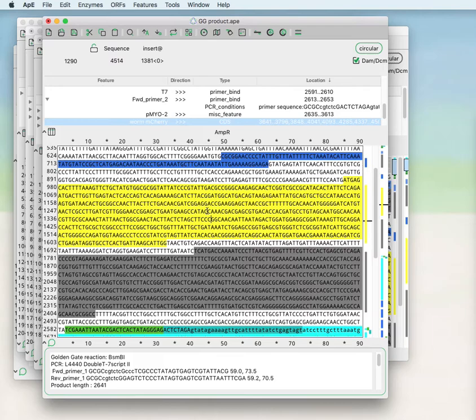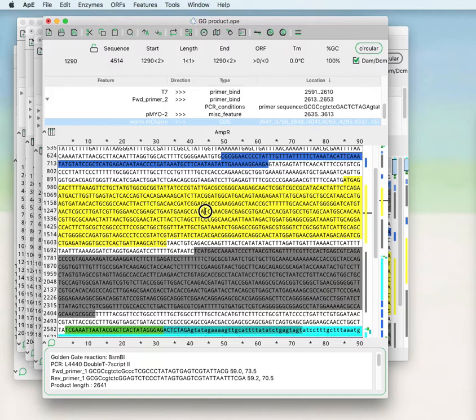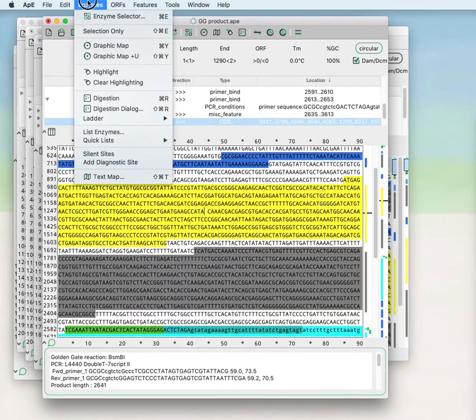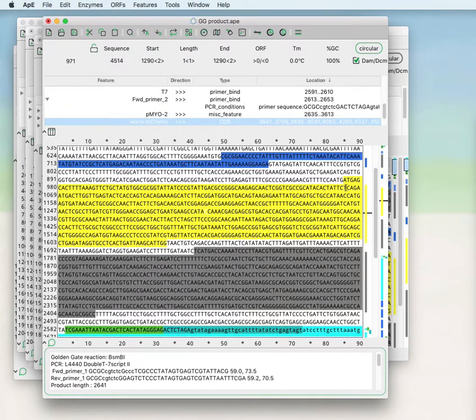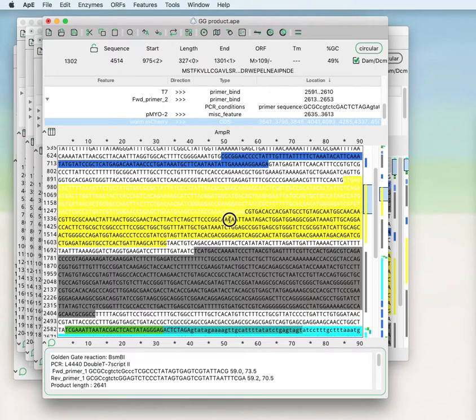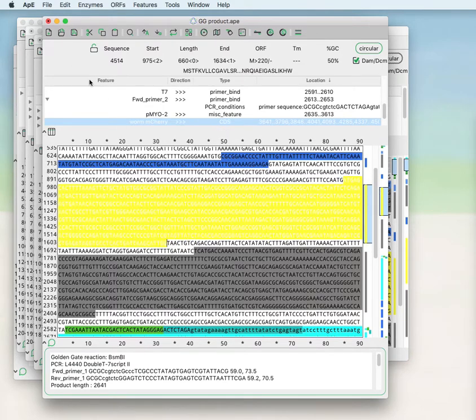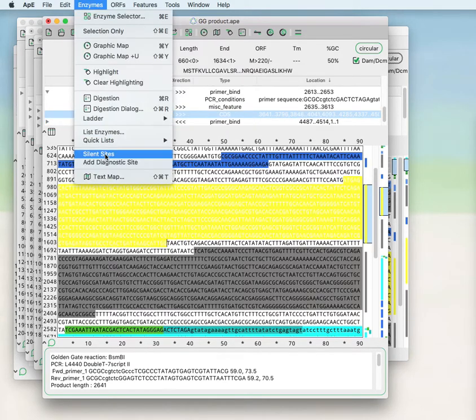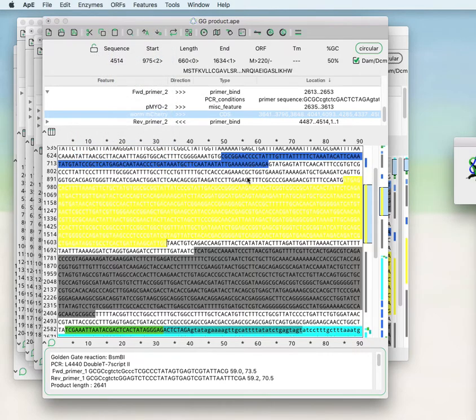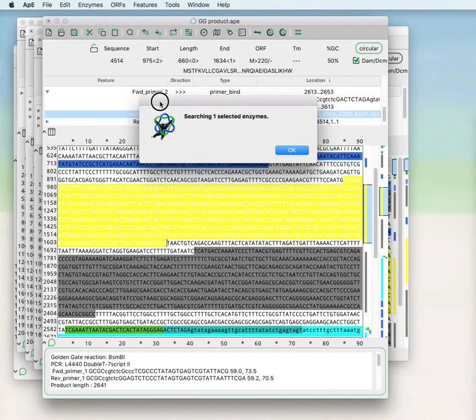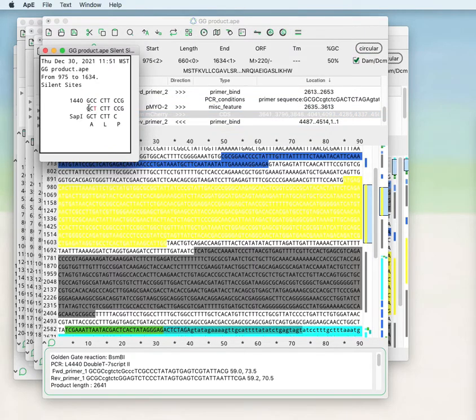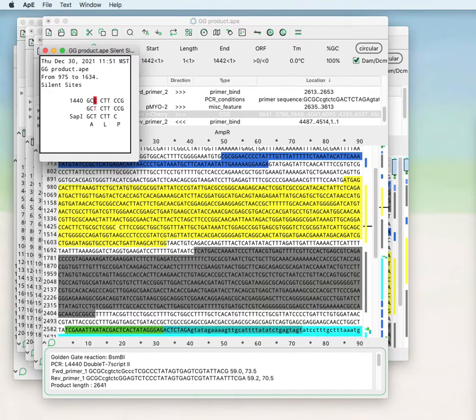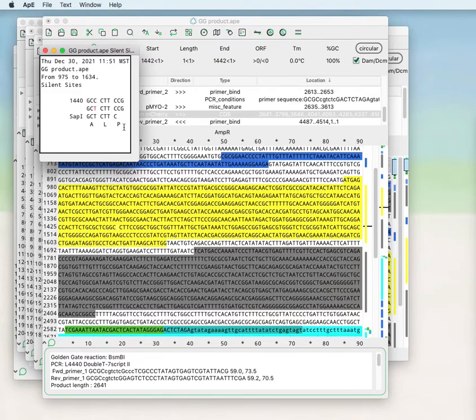On the other hand, if you'd like to introduce a mutation for use as a diagnostic within mutagenesis, there are two options. You can either do silent sites where it will preserve the open reading frame while searching for restriction sites. For example, if I wanted to introduce a Sap1 site within the ampicillin resistance gene, I could introduce that silently, leaving the Amp translation frame intact by inserting this T in place of this C within the sequence.